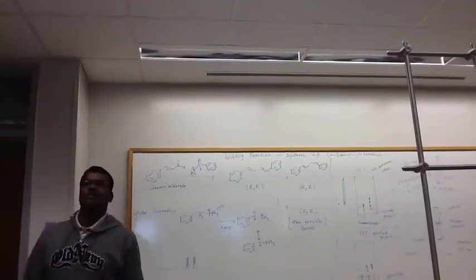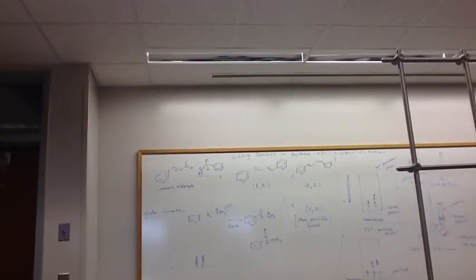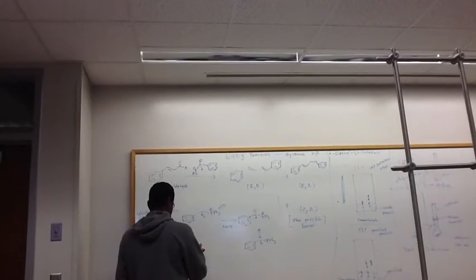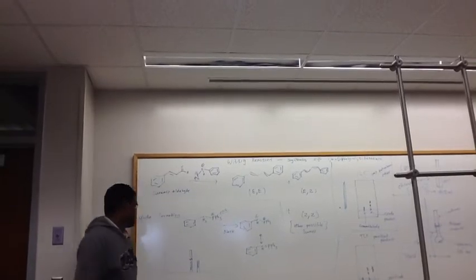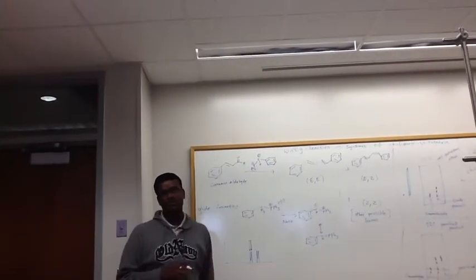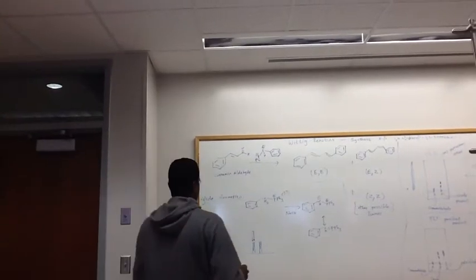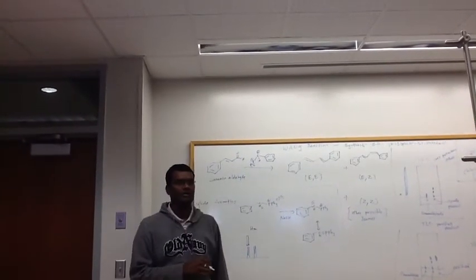So we have some peaks with a splitting of 2 that you can call a doublet, right? The difference between the 2 splitting, you can measure in hertz, represented by Hz. Hertz, okay?